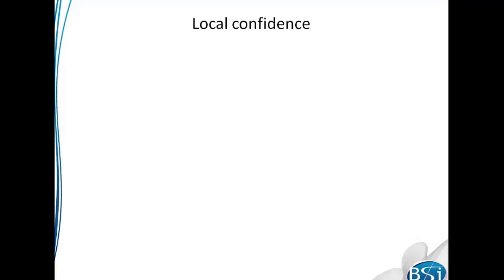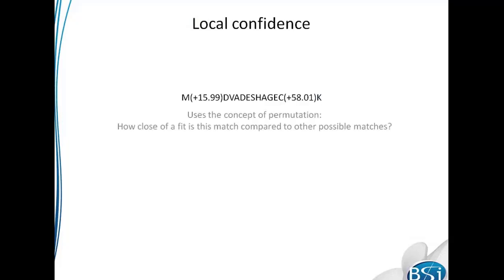All right, so the next general principle behind PEAKS Denovo sequencing is that once we predict the most likely Denovo sequences for every spectrum, it will generate thousands of possible candidates and then score them. It will then assign local confidence scores to the amino acids in the most likely de novo sequences for any spectrum. So what it does with this is, let's take an example here.